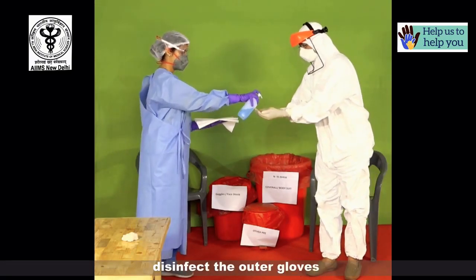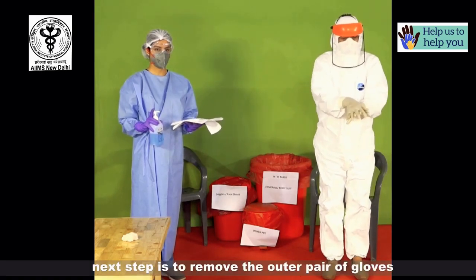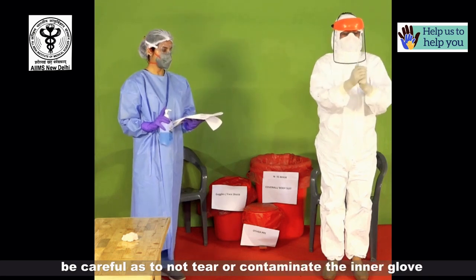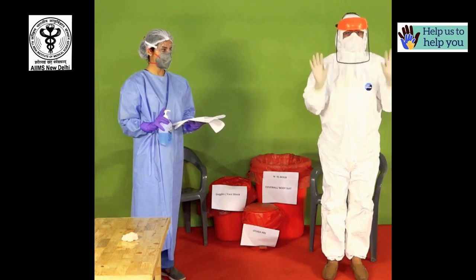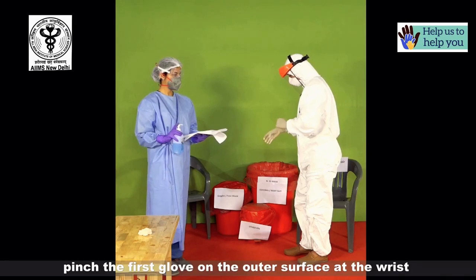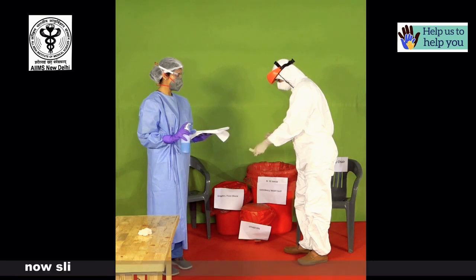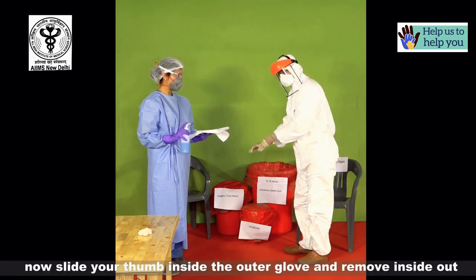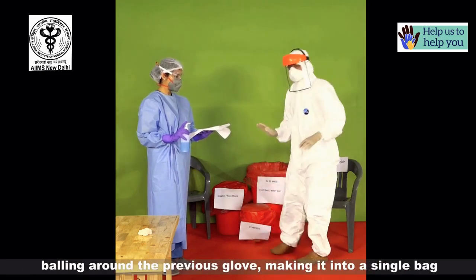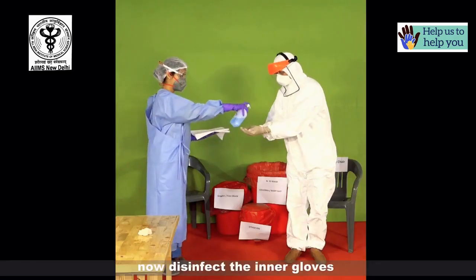Disinfect the outer gloves. Next, remove the outer pair of gloves, being careful not to tear or contaminate the inner glove. Pinch the first glove on the outer surface at the wrist and pull it inside out. Hold this glove in the other hand like a ball. Then slide your thumb inside the other glove and remove it inside out, balling it around the previous glove to make a single bag.